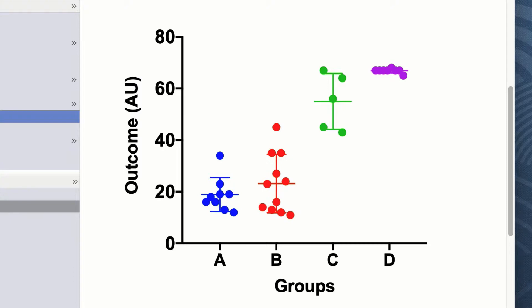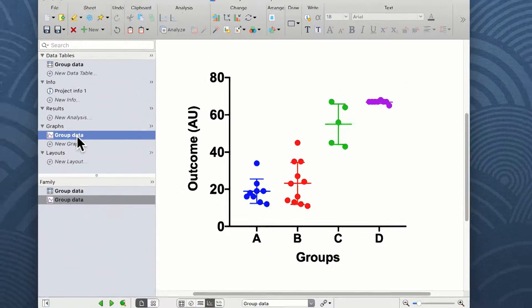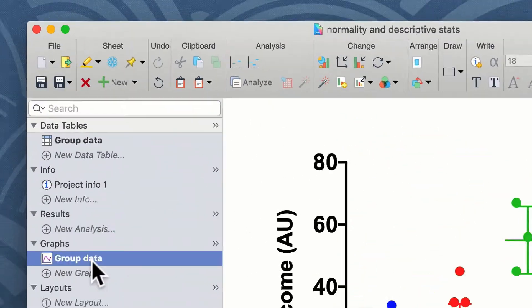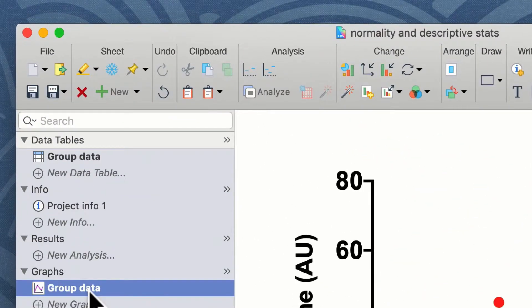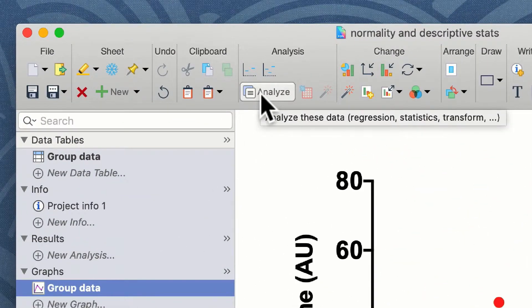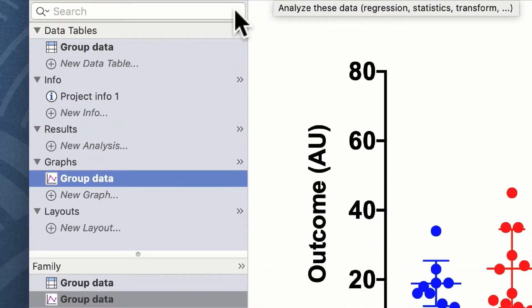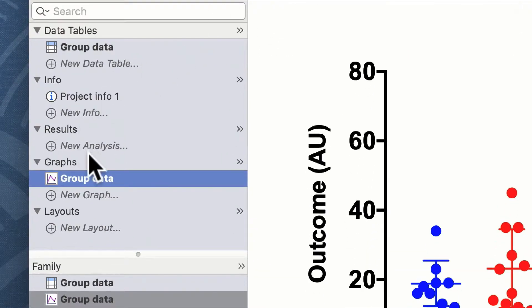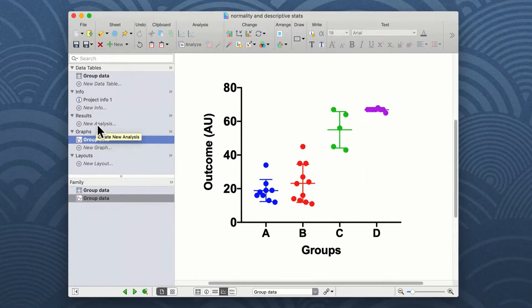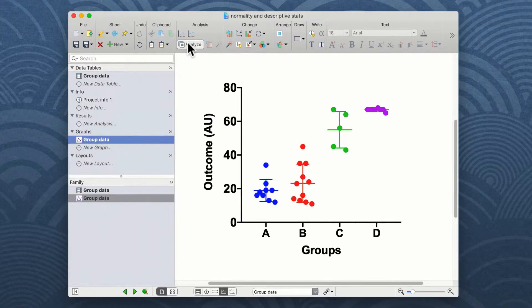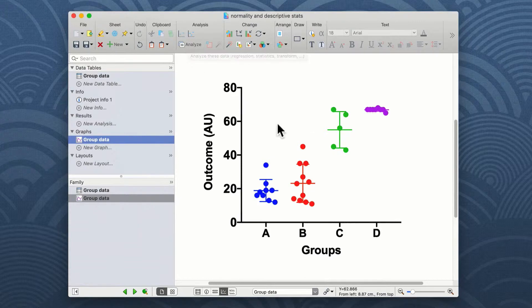You can carry out descriptive statistics on any column of data in Prism by clicking on the analyze button in either the graph or the table view, or click on new analysis within the results window. In this example, I'm going to click on the analyze button from the group data shown here in the graph.